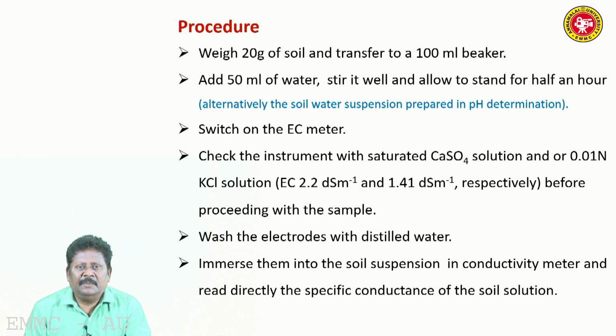After measuring the pH in the pH meter, the same suspension can be used for determining the EC of the soil.